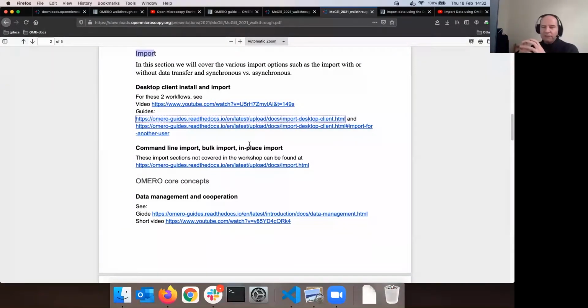But you have also other means how to do stuff. Which would be the command line interface, where there is just a prompt and you can type some commands. Okay, so if you are not scared about the command line, then there are some ways how to achieve import here as well, and this would probably be more interesting for the, so to say, super users like facility managers here, etc. That would be for the introduction. If there are no questions for the introduction, let me ask a question. Did you manage to install OMERO.insight, please?